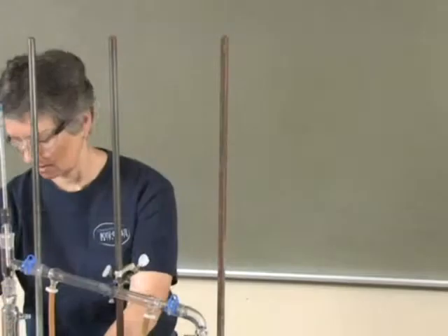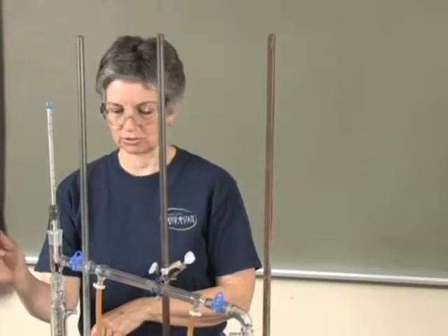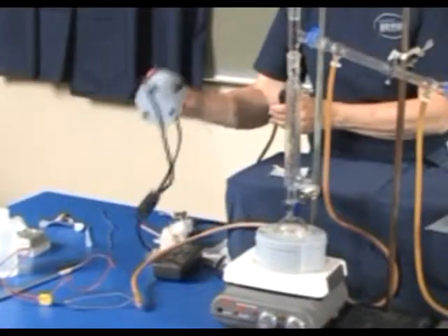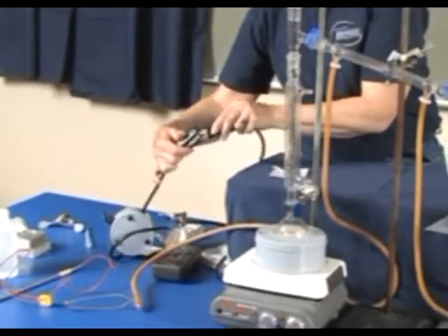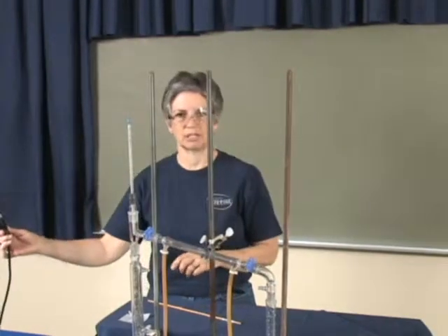The heating mantle, even though it has a 3-prong plug, cannot be plugged directly into an outlet. That gives it full power, and that's too much, it will burn it out. It has to be plugged through a variac or a power control. So the heating mantle goes to the variac, and then the variac is plugged into the outlet.